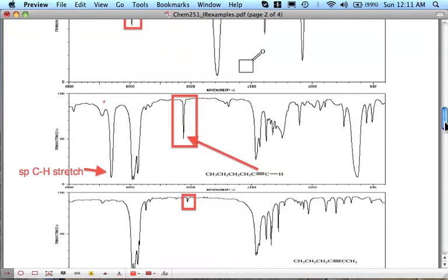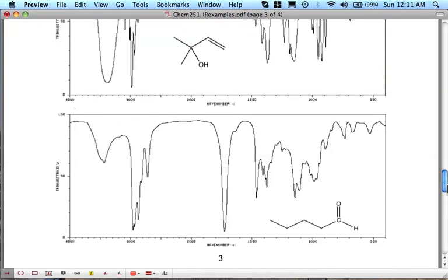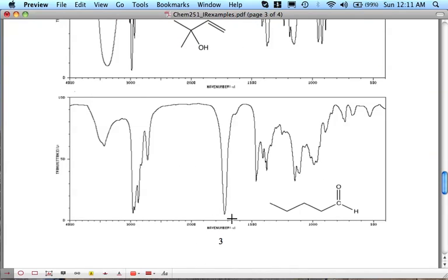So I'll go down, and sure enough, there's our carbonyl, remember, slightly above 1700. There's one of the CHs right around 2750. And there's the other one right there on the shoulder, almost hard to pick out, right? But that guy's very distinctive, so that's pretty confirming. But that's not really what I wanted to show you or emphasize here. What I wanted to emphasize was this funny peak right here.